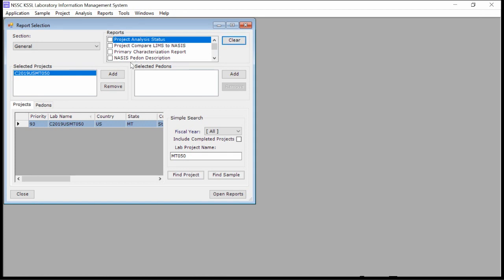And if something has been hanging out in one of those columns for a while, you check it several times and it keeps showing up as not available or something, then you could ask Scarlett. She could investigate exactly what the problem is. And at some point it might be, okay, well, there's just not enough to make the fine grinds, so then it might be shifted to abandon, and that would mean that won't show up on your final data.